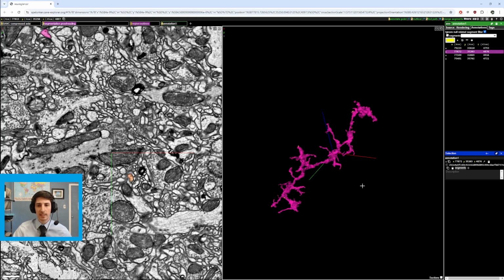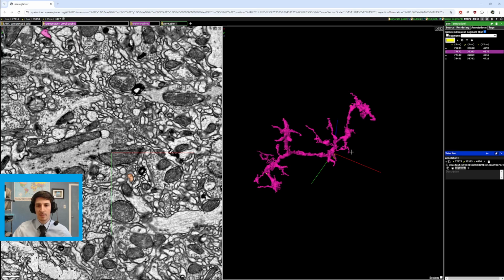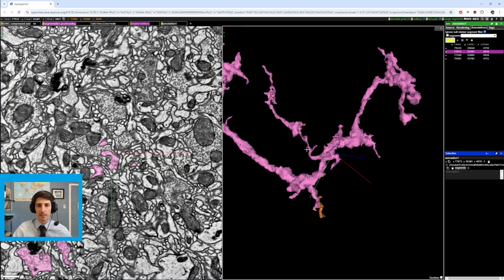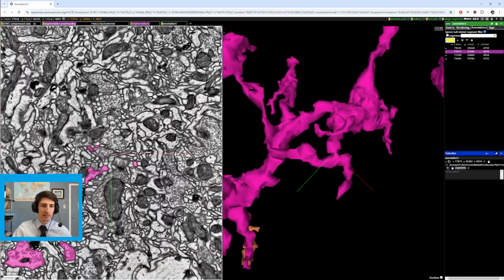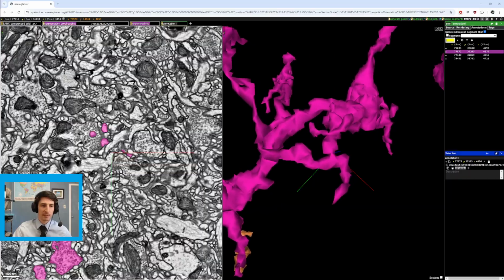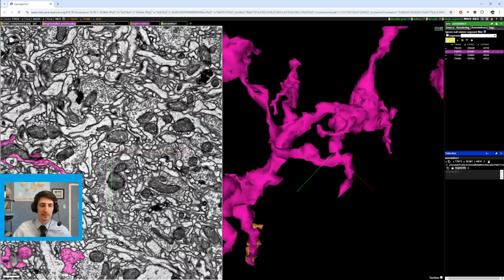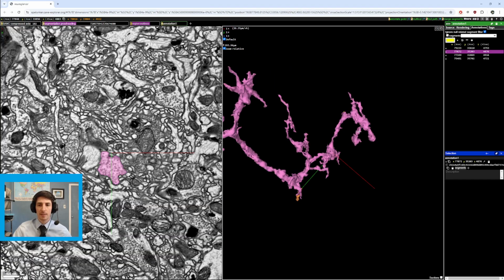So the next thing I'm looking at is maybe this, but that's kind of thin, and this branch is kind of thin as well. In fact, I would say that this is probably a merger, but we're looking for a continuation at this time instead of a merger, and even if it was a merger, it is quite a small one, which we could determine at a different time.